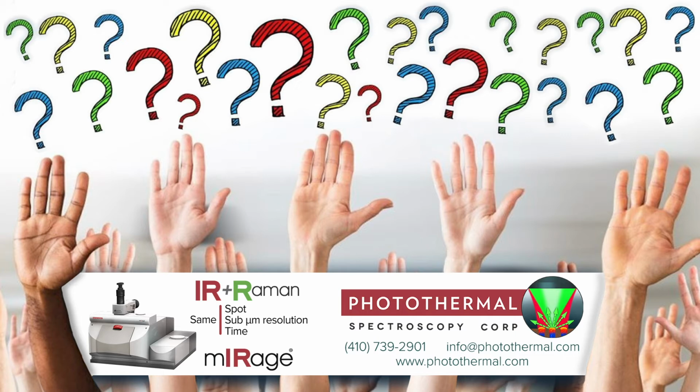I was wondering if it affects this photothermal spectrum, simultaneously. I don't think it does. No, because the excitation is by the infrared, and the detection is the Rayleigh beam. Yeah, you can, for example, turn off the QCL and do just Raman. So you can turn off the IR part. I understand. Raman or resonance Raman. I'm still wondering, but anyway, I will discuss it. It's probably not a bad issue.